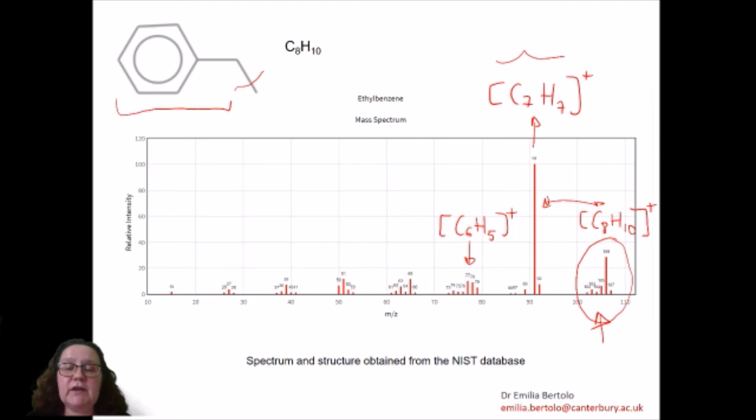And finally, my suggestion would be that you do not focus on all the peaks, interpreting the whole spectrum, but pick a few of the most abundant peaks and see if you can identify them. And I would suggest that you do not focus on very low mass to charge ratios. Although, for example, I can just spot here a 15, which is probably attributable to a CH3, so I might as well identify it since I have just spotted it.